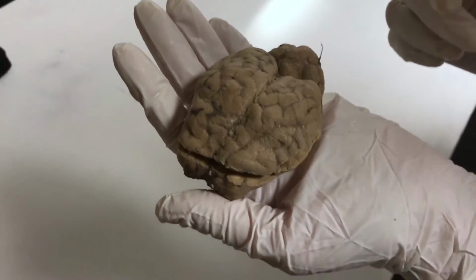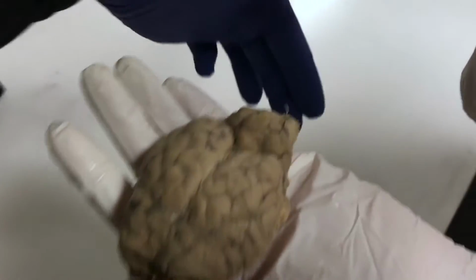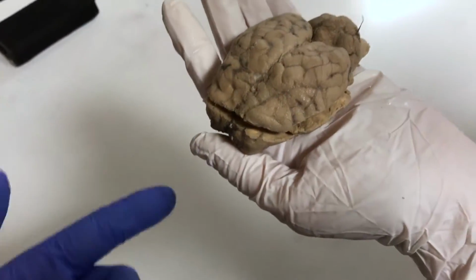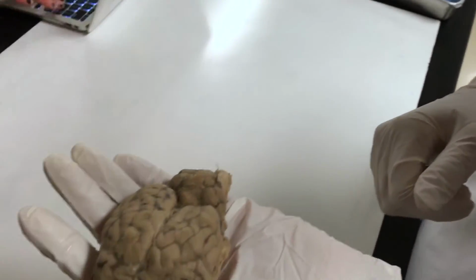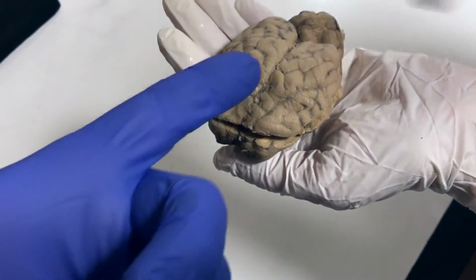Just for orientation of this brain right here, you can see that this right here would be where the front of the sheep would be, and this is the rest of the sheep. So mouth would be somewhere in this vicinity, and everything else is behind it. So the front part of the brain, in which a lot of thought processing happens, is the cerebrum right here.